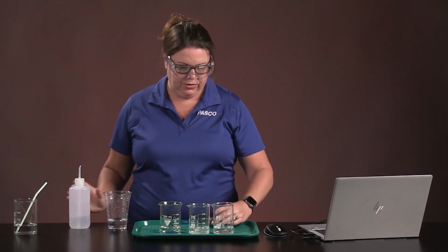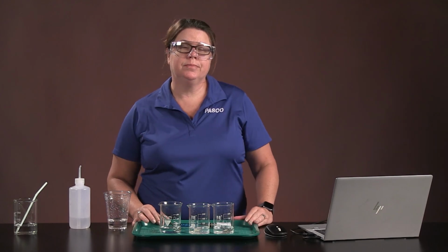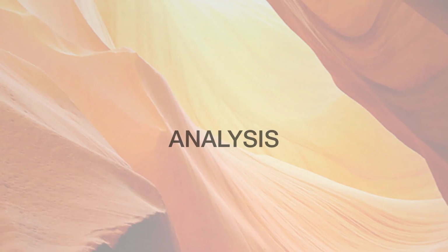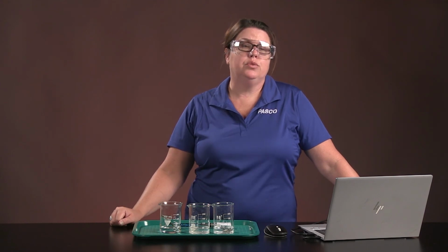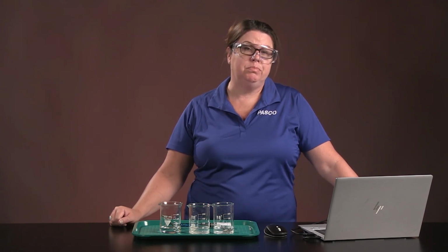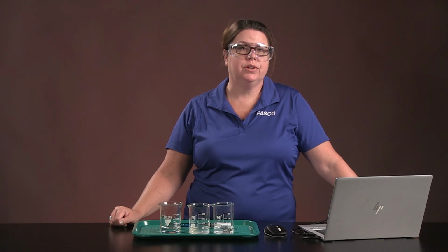Okay, so that wraps up our data collection. For the analysis portion of this investigation, you will refer back to your observations and pH readings to answer the questions on the student sheet.